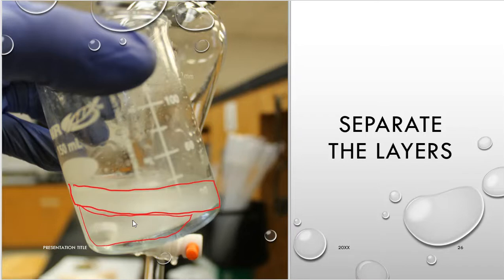The reason that there's two layers at this step is because we used methylene chloride, or dichloromethane, DCM, as part of the reagent in the reaction. And now I've added water to this whole setup, and water and methylene chloride hate each other. One's polar, one's not polar. They never get along, and they begin to separate in the beaker. So that's the purpose of the separatory funnel step that you will see in the upcoming videos.